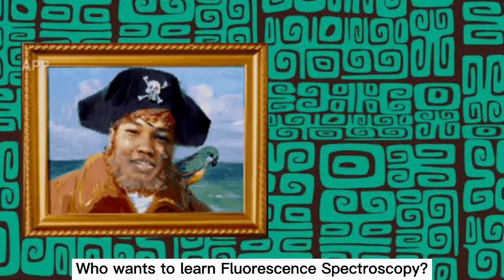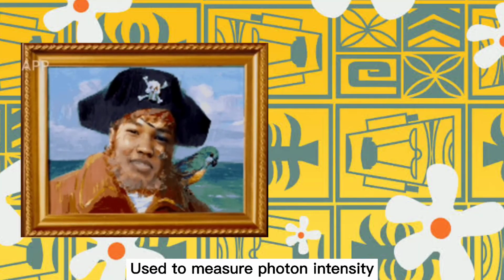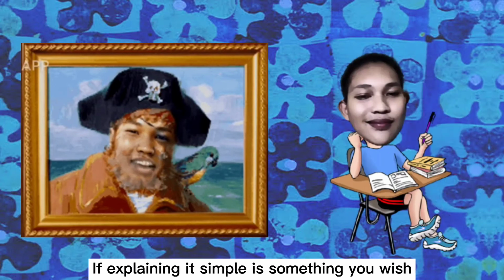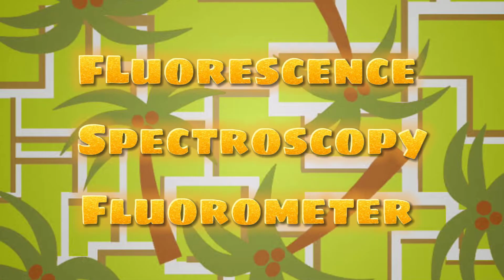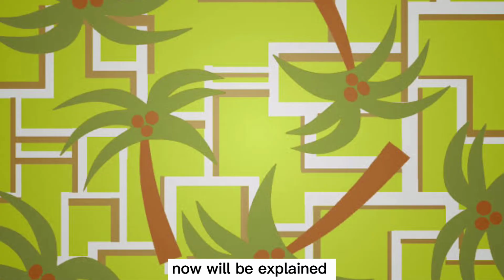Who wants to learn fluorescence spectroscopy? Used to measure photon intensity: the fluorometer. If you wish to have it explained simply, go watch and learn. Drop what you do and watch like a kid. First year bio: fluorescence spectroscopy. Fluorometer. Now we'll have it explained by the teacher.